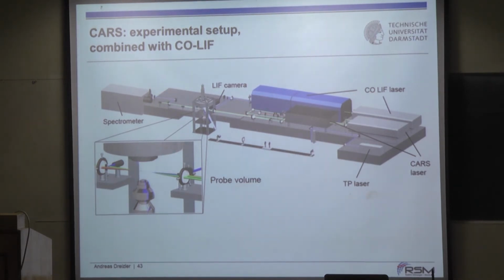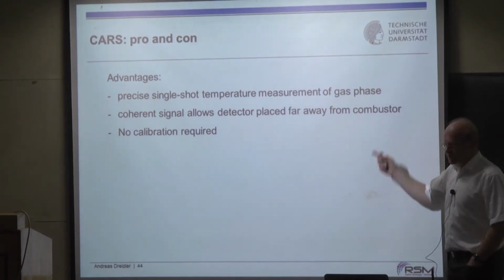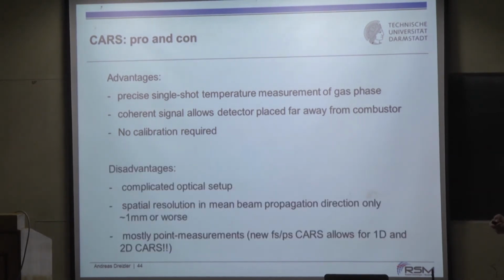Okay? All right. Let's have a close look into the pros and cons. It is precise. It is capable of single shot in the gas phase. The coherent signals allow you to have the detector placed far away and no calibration required. The disadvantage is complicated setup.